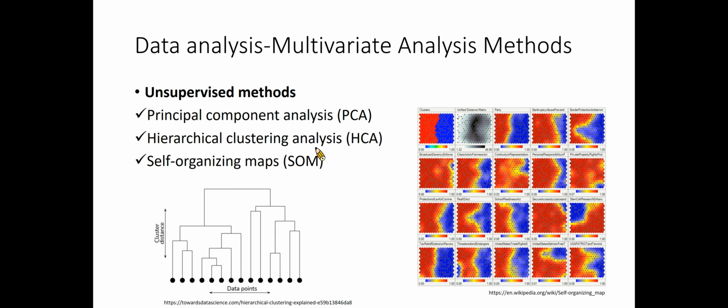PCA is also used in metabolomics studies to assess data quality, since it can identify sample outliers or reveal hidden biases in the study. For example, PCA has been used in several studies to determine the impact of technical variation in the analysis of metabolic profiles.